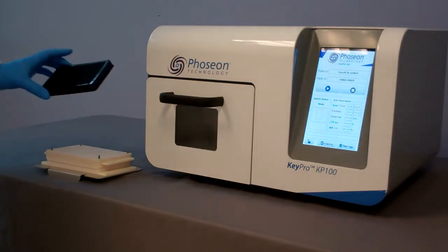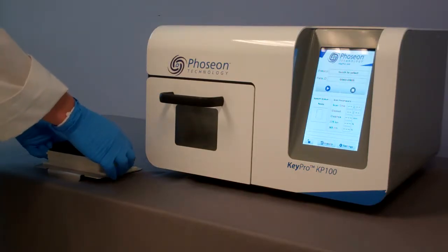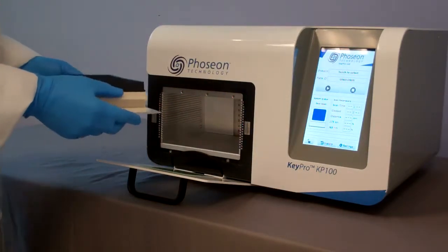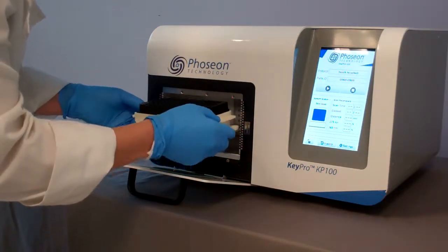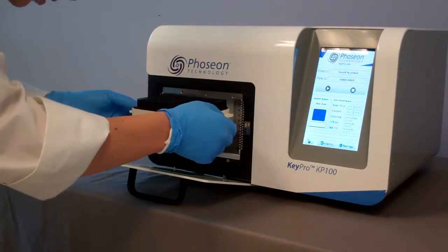Place the microplate on the stage with the alignment pins in the corners or bracketing the outside for unskirted plates. Find the highest shelf height that allows free insertion without compression of the stage. Realign the shelf height to 1 slot higher.